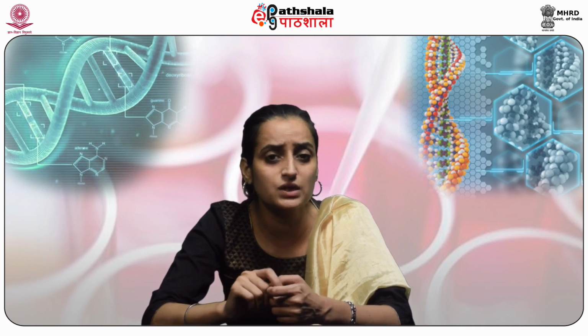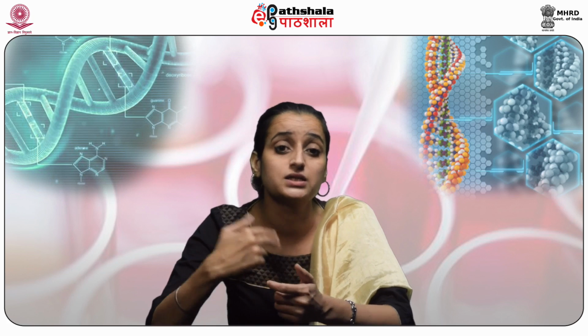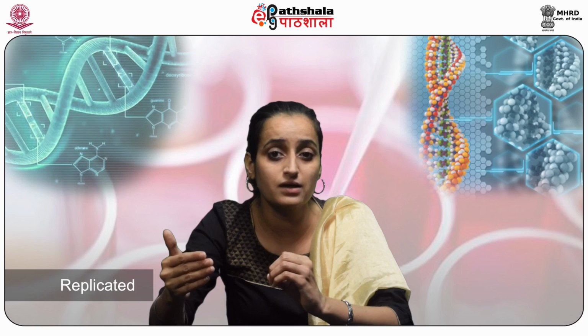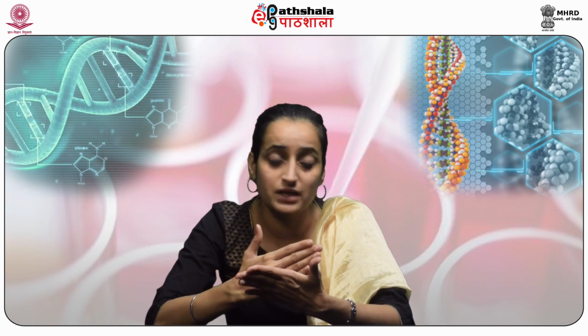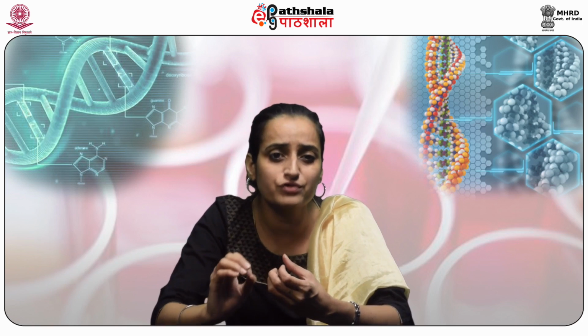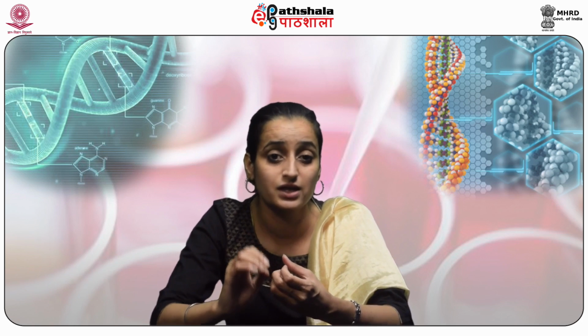However, if the sequence is not known, then double-stranded DNA probes can be used. The fragment can be cloned in a plasmid, replicated in bacteria. Bacteria then can be lysed to obtain the plasmid, and the plasmid is then purified, and in the end, restriction enzymes can be used to excise out the fragment of interest to be used as a probe.